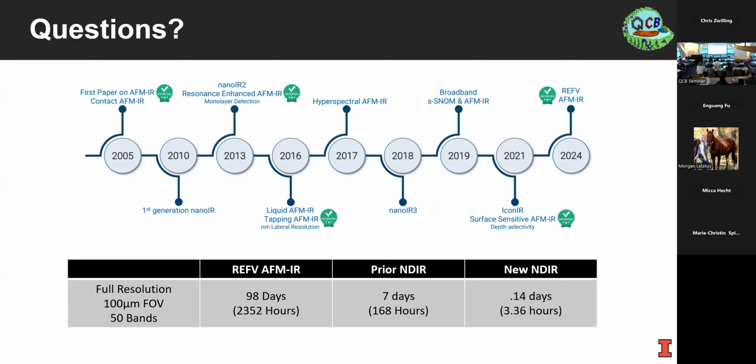Yeah, and there are plots that show how these fields behave. The signal is generated by the electric field enhancements produced by the gold tip, and they scatter out approximately the radius of the tip. So it's on the order of 10 to 40 nanometers. So that's pretty good. Even in a bacterial cell, you get quite a nice set of voxels. Yeah, and we're actively exploring that as a third aspect of this system, and we have some good understanding of the depth sensitivity of where we're getting signal, and we're trying to lock that down to know exactly that we're getting this surface sensitive measurement.